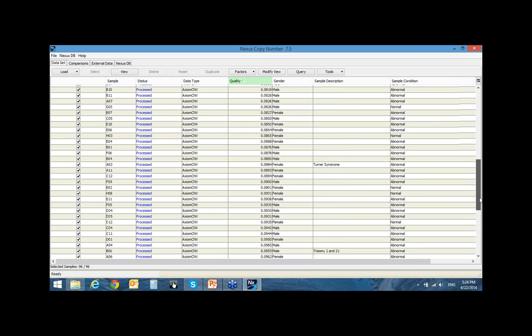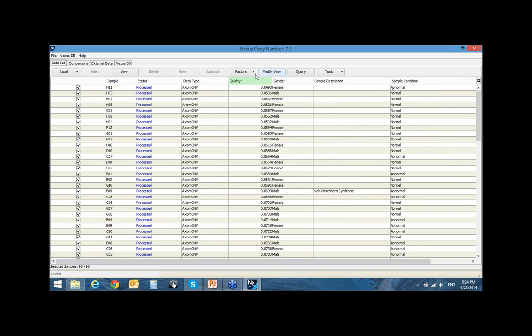And here you can see I have 3 other columns which I added using the so-called add factor function. You can add factor, you can load factors. The factors are actually the phenotype or the clinical factors for each sample. You can add as many columns as you want by simply doing add factor. Sometimes people have that information already, and they simply load the factor from the file. So we'll populate this table with all those columns with those values.